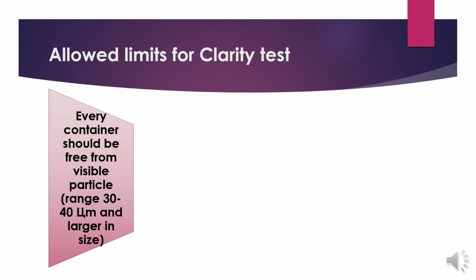If even a single visible particle is available in your container, your product, your vial, your ampule, it is rejected. So this is the first condition. Every container should be free from visible particles.